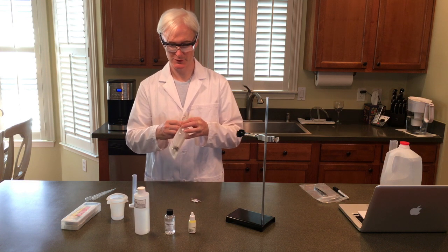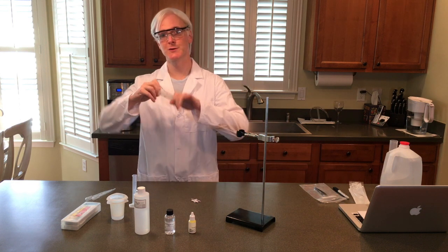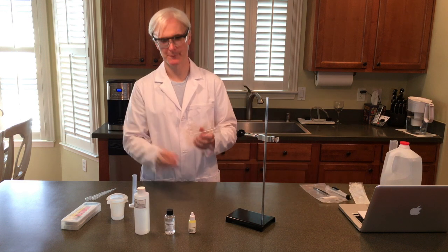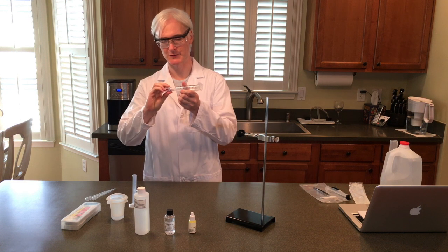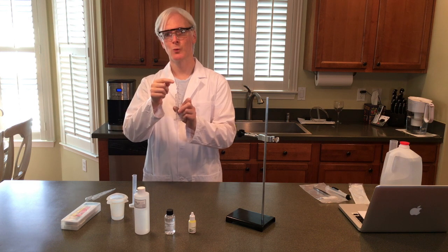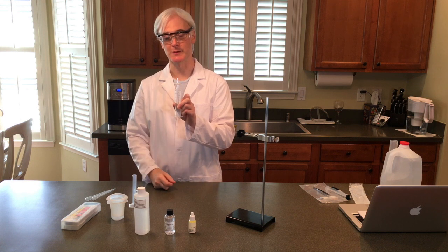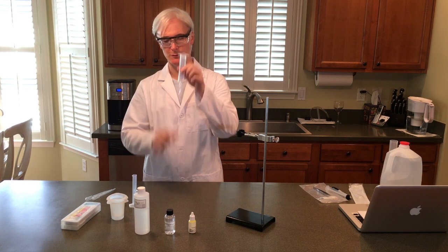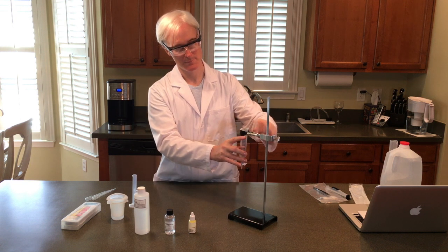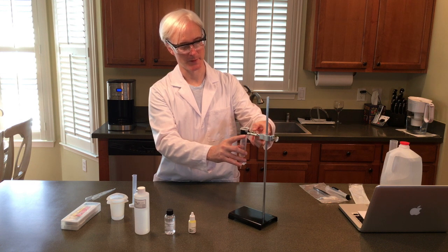Open the syringe. Remove the plunger. And attach the stopcock to the end. When it's in the vertical position, you know that it's open. When it's in the horizontal position, you know that it's closed. We're going to be using it this way. Nice and secure.